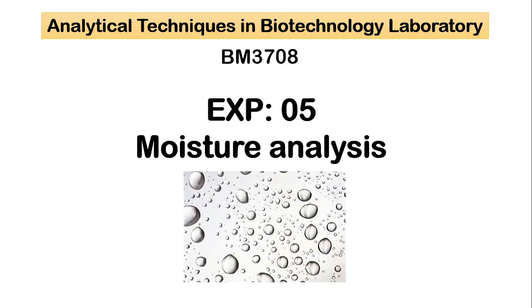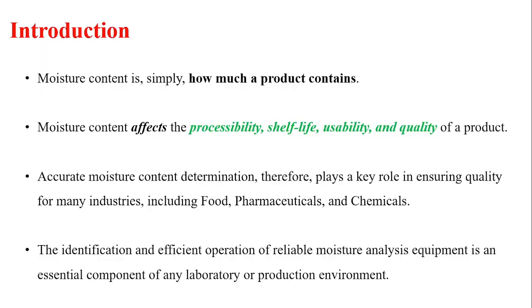Good morning, everyone. Today we'll be performing moisture analysis. Moisture content is simply how much water. Moisture content means how much water is present in any product that we are going to analyze.